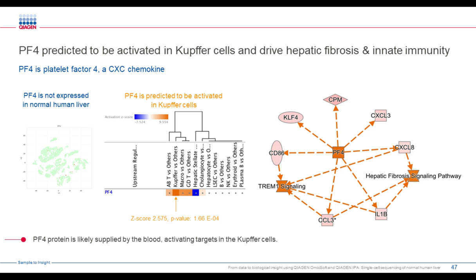So one question was, if you put the targets of PF4, which are represented here by these immune proteins, CXCL3, CXCL8, and many others, you connect them through PF4 because, based on the pattern of expression of these genes, we have identified that PF4 is predicted to be up. We have asked the question, let's connect the most significant canonical pathways that we have defined previously.